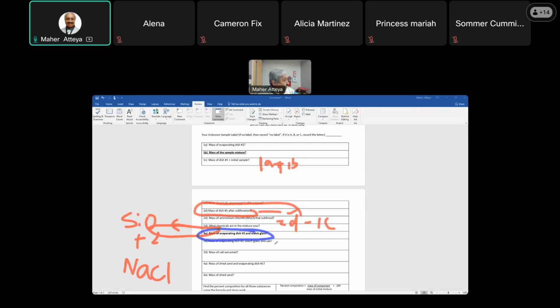What happens is we have the effect of popcorn, in the sense that when we heat, it will generate a lot of pressure, the vapor pressure of H2O, and it will start boiling, taking the crystals out. Popcorn effect. White sodium chloride crystals will start popping out. Therefore, the watch glass comes to prevent this popcorn effect of the crystals of sodium chloride. But you have to make sure that everything is dry. The watch glass should not be wet. Everything in the crystal will be dry.